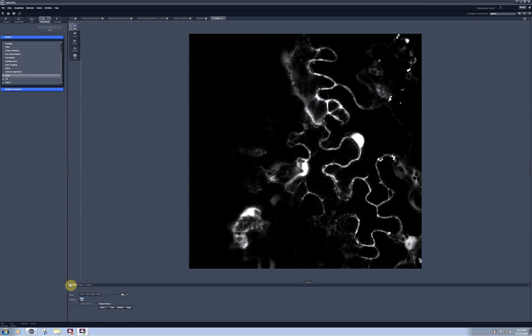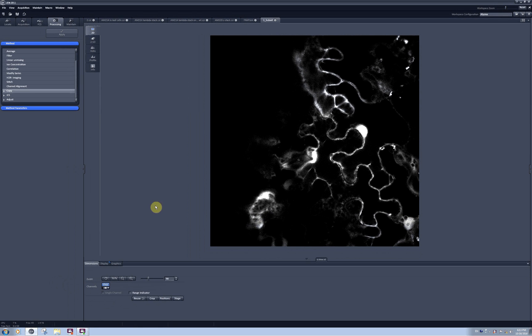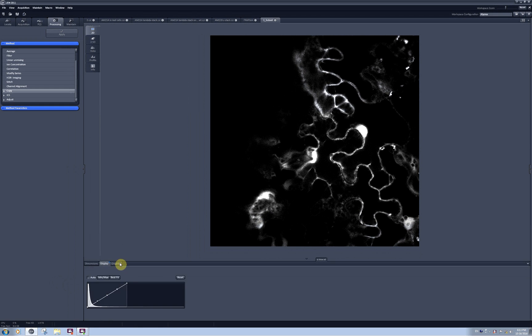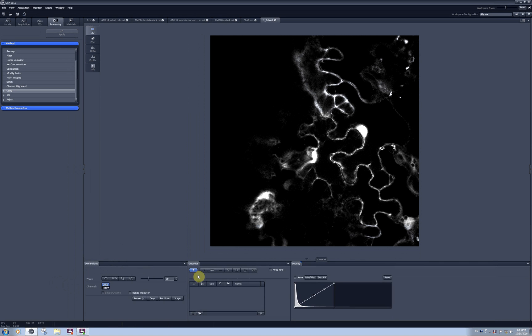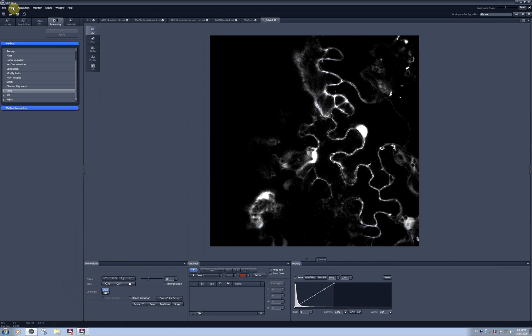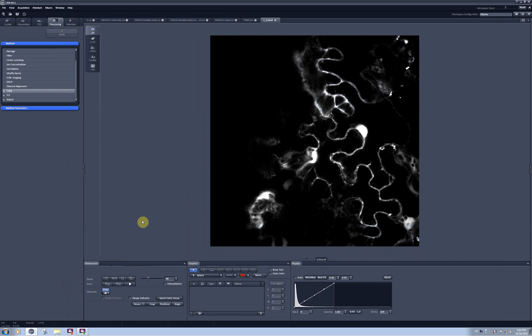In the 2D tab you have access to three tabs on the bottom panel called Dimensions, Display, and Graphics. You can click between them or, if your screen is big enough, pull some of them out to see several simultaneously. Please make sure that 'Show All' is checked everywhere in the software. It is best practice to go to View on the top menu and activate Show All Global.